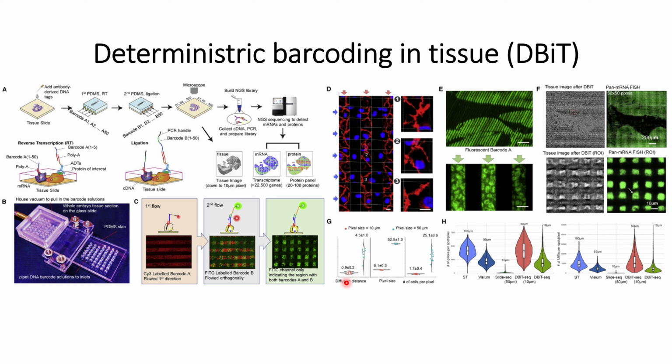And also one thing that they mentioned is that these deviations are maximums that are present at the edge of this macro channel plates. So these are the maximum deviations. However, within these macro channel plates, the deviations are much less.